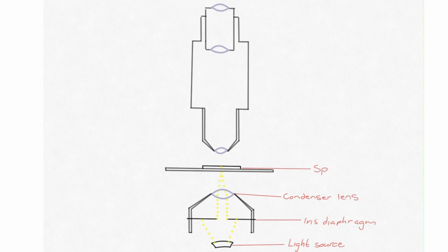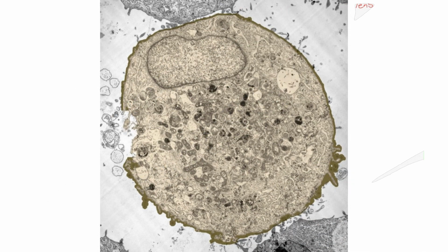After the light has passed through the specimen, it will move through the objective lens as well as the eyepiece lens. Both lenses will magnify the image. Thus, if you want to calculate the total magnification, these two magnifications would need to be multiplied.